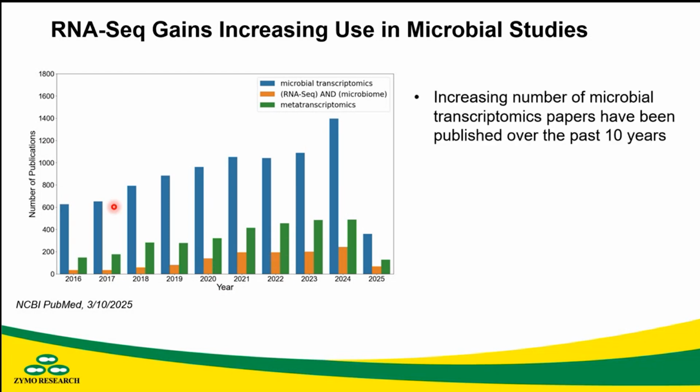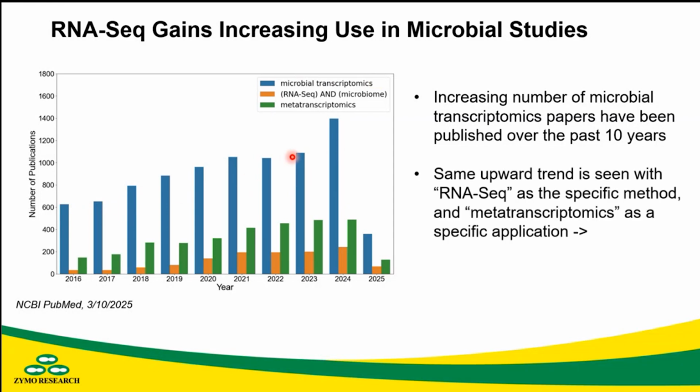Now we're seeing an increasing number of microbial transcriptomics papers being published over the past 10 years, exemplified by this increasing blue bar.